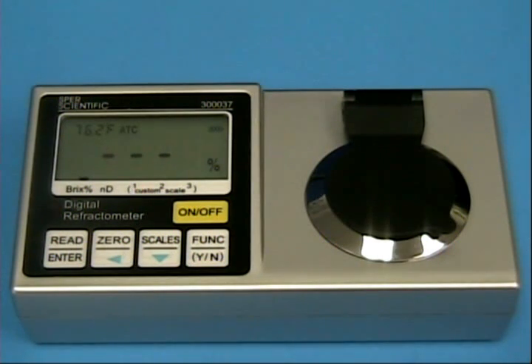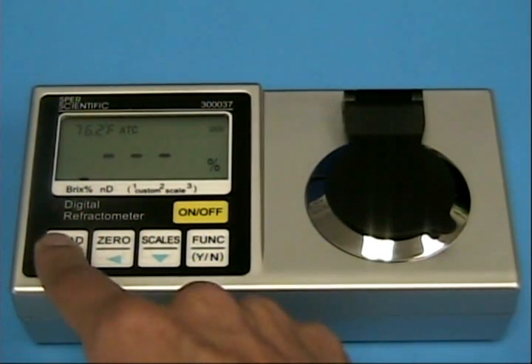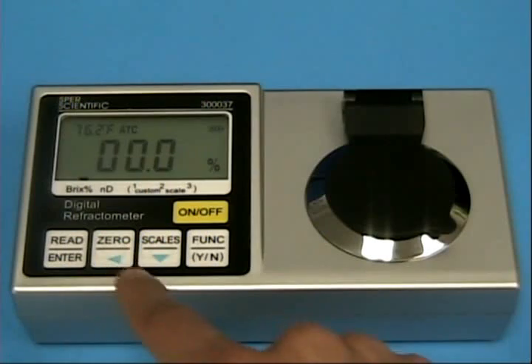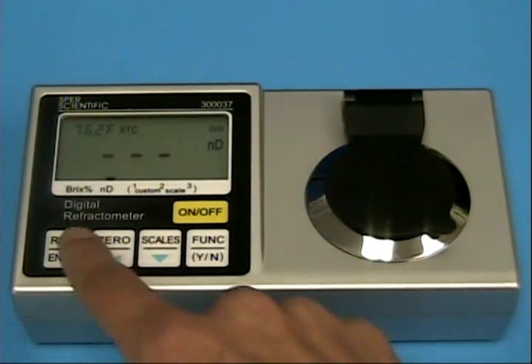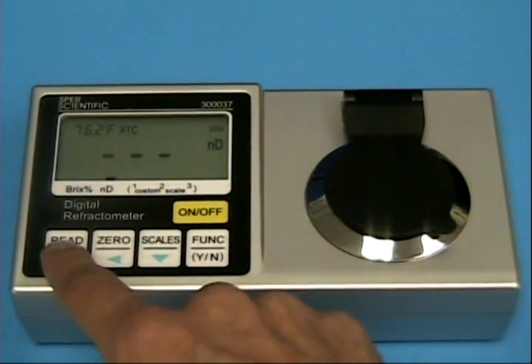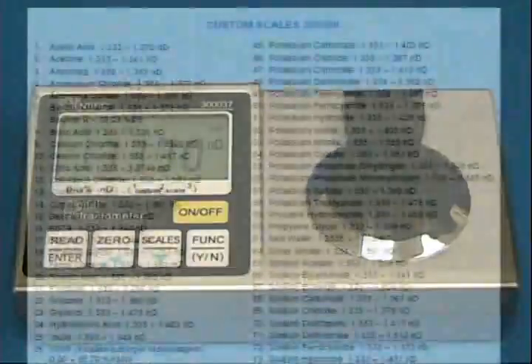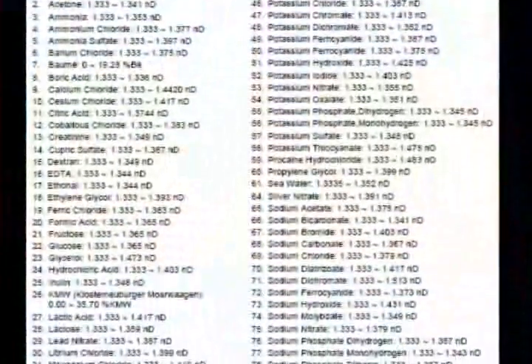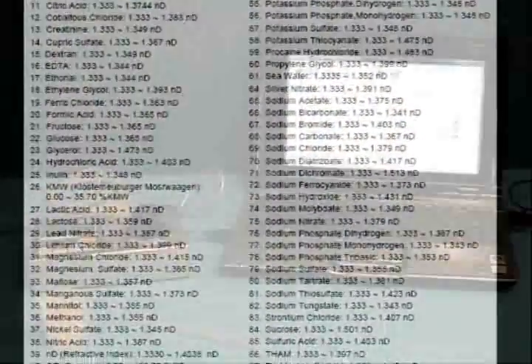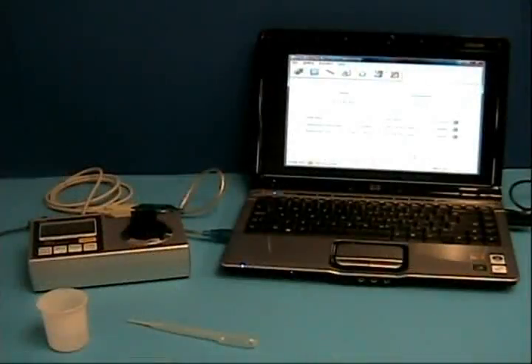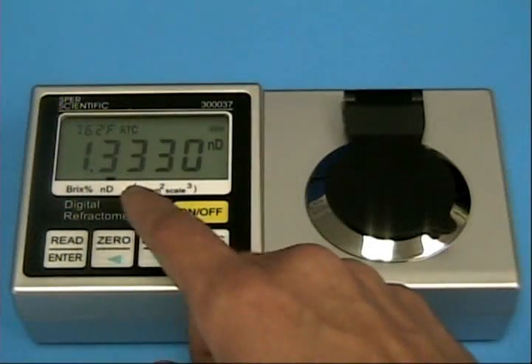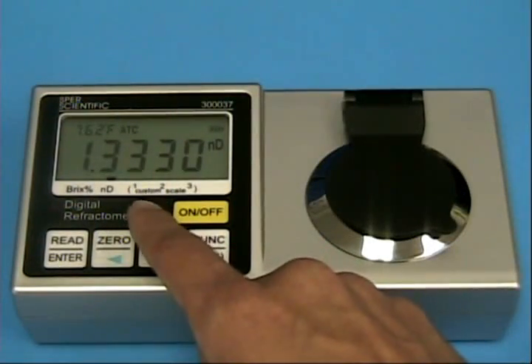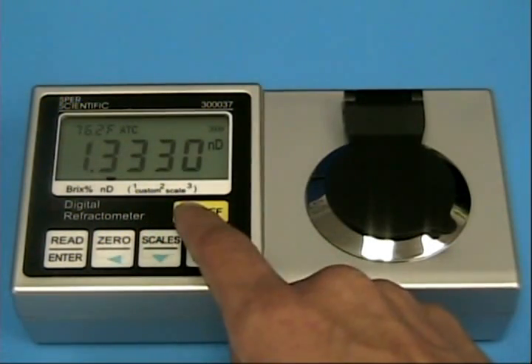The programmable refractometer comes pre-loaded with commonly used BRIX and refractive index scales. In addition, we have many application-specific scales, or you can create your own scale on the computer and load them to these three display positions.